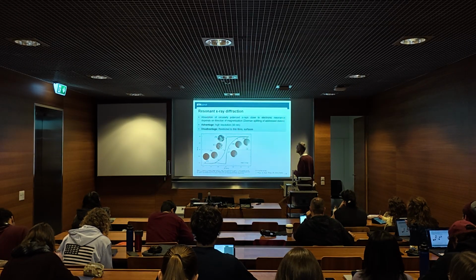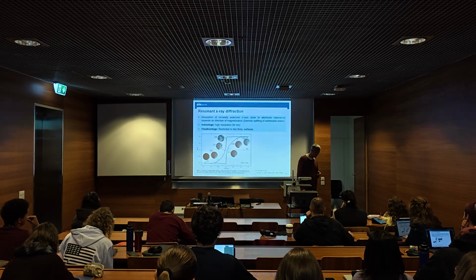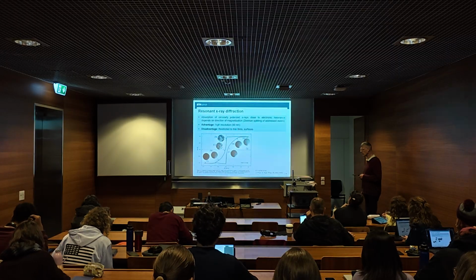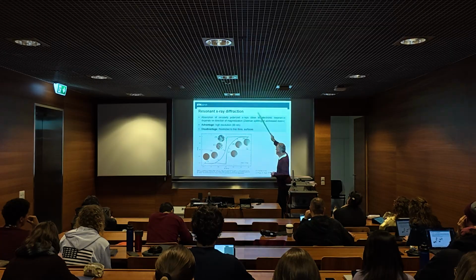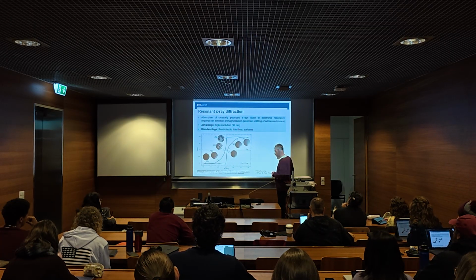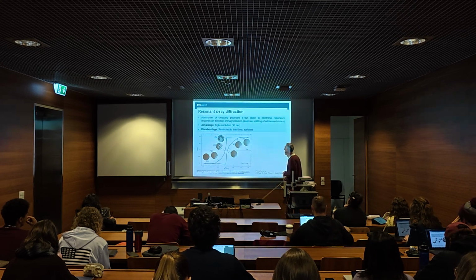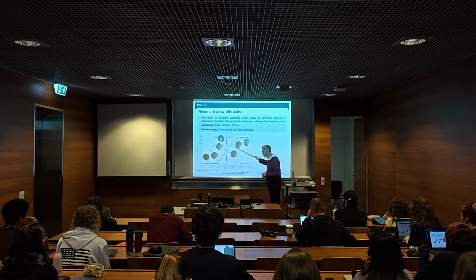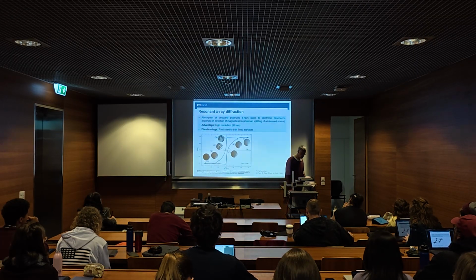X-ray diffraction can do it. Not normally, because photons do not directly interact with spins. But you can have spin-dependent electronic bands in your material that create absorption, and that's something that X-rays can see. So then you can image throughout a hysteresis of a ferromagnetic film, I think this is a gadolinium iron alloy. You can see how the domains are distributed with spatial resolution and then associate them with a point on your hysteresis.